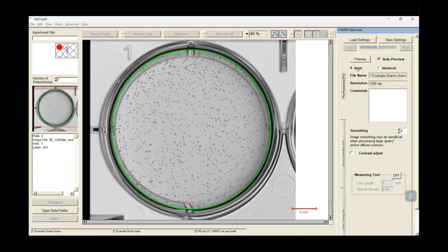And before I move on, I do want to quickly explain how these 3 tabs work. The way they are meant to work is in a top to bottom fashion, meaning any change made to the available settings in an individual tab will have a downstream effect on the tabs below it. So we always start from our top tab and work our way down. The idea here is that by optimizing and adjusting the tools and functions provided, we'll end up with the sort of decision making by the algorithm that we feel is appropriate for our study. So with that, we will start with our pre-process tab, which is the one we're already in.